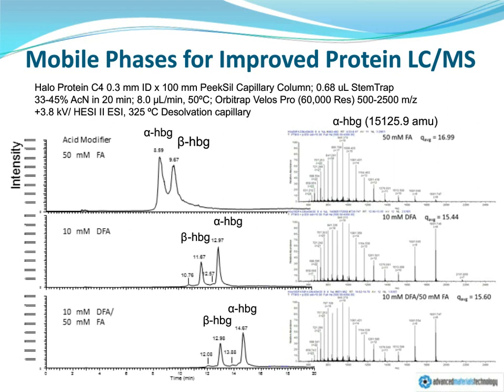But most importantly, we're beginning to pull variants of the different subunits of hemoglobin away from the main peaks, where we can realistically obtain mass spectral data so that we can assign or assess the correct molecular mass for those protein variants. So there does seem to be advantage to the use of alternate mobile phase modifiers for intact protein or protein subunit separations.